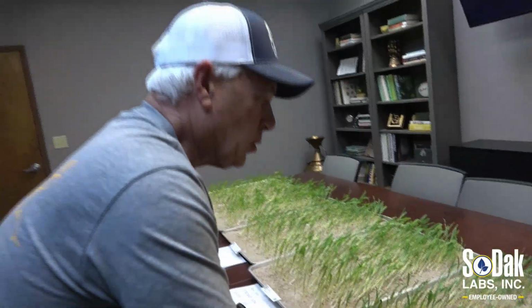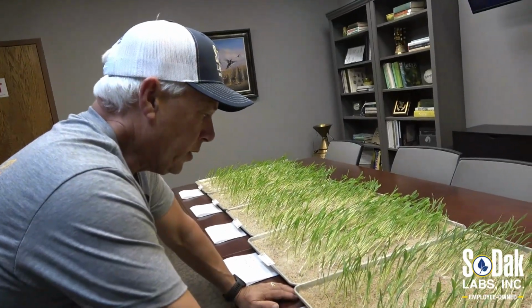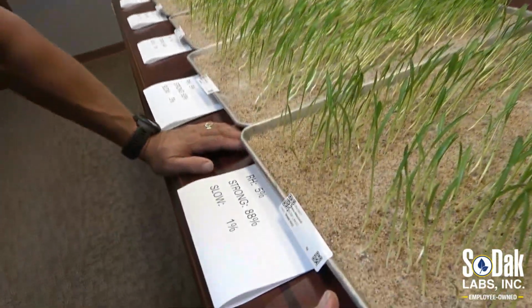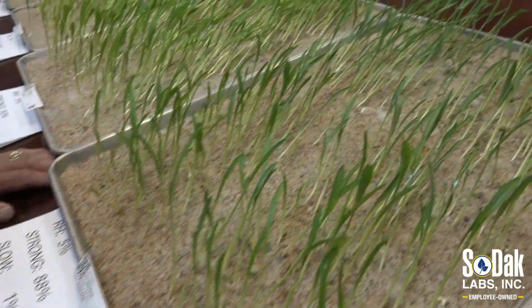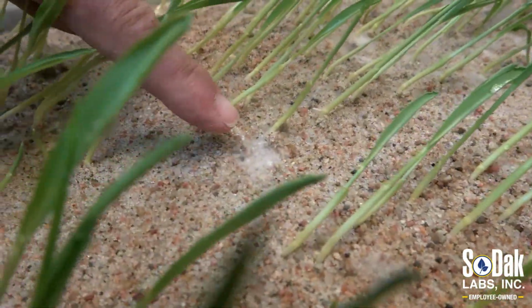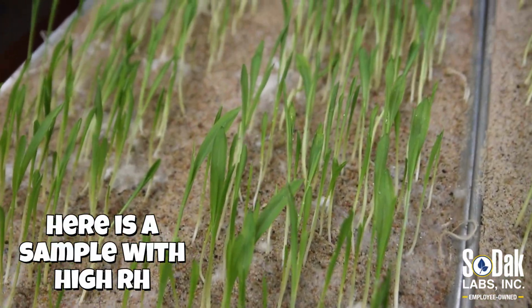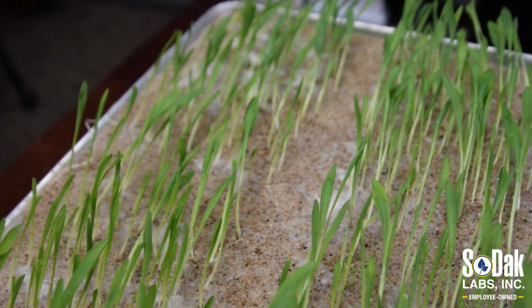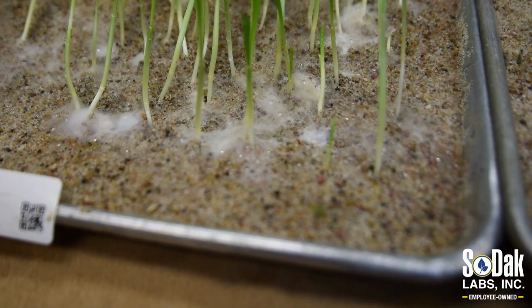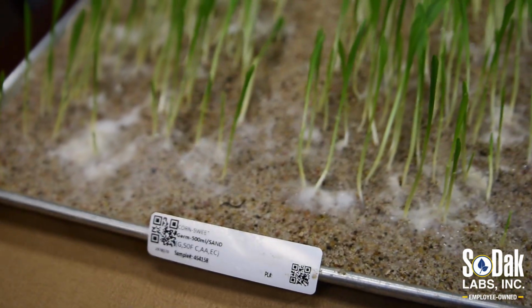So this lot of sweet corn here, this specific one, we see a decent 89% germination, and we do rate the presence of saprophytes. And here you can see a little mycelium growing on the sand, and that could be Rhizopus species or Mucor species, but it's considered a saprophyte, not a pathogen. It's really living off something leaking out of the seed, and likely sucrose.